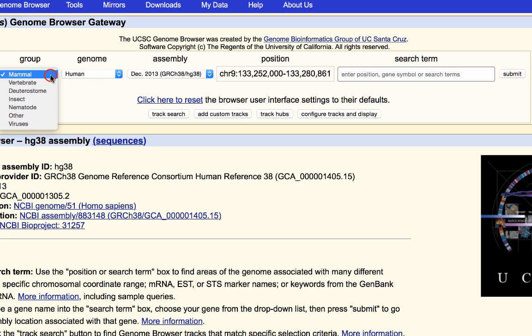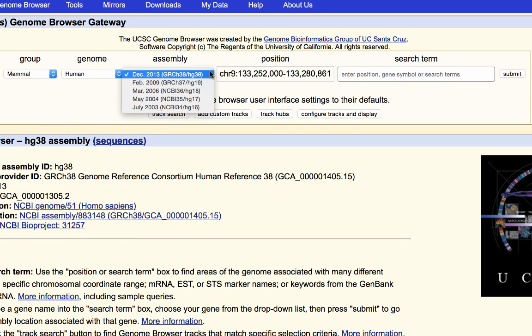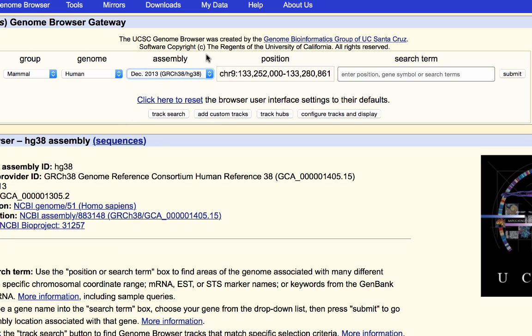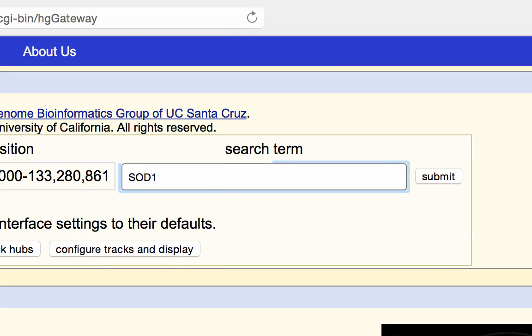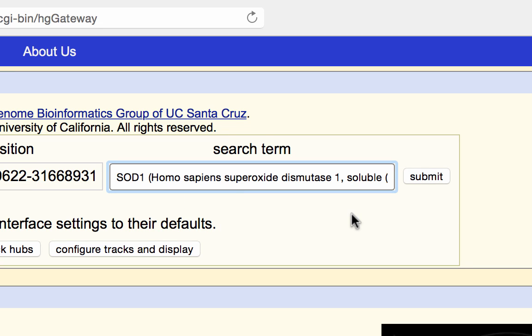We'll select Group: Mammal. Under Genome, we'll select Human — there's also Mouse and a wide variety of other animal genomes available. Under Assembly, we'll stick with the default, the most current December 2013 release of the HG38 assembly of Human. Under Search Term, we will select a specific gene. I'll enter SOD1 and click on that box because we want to go look at the SOD1 gene specifically. Let's click Submit and go through to the Genome Browser.